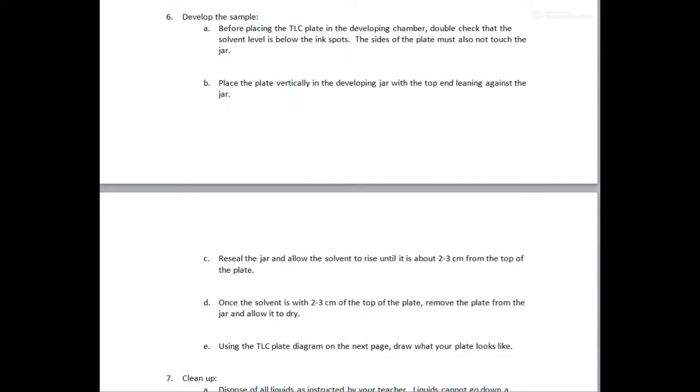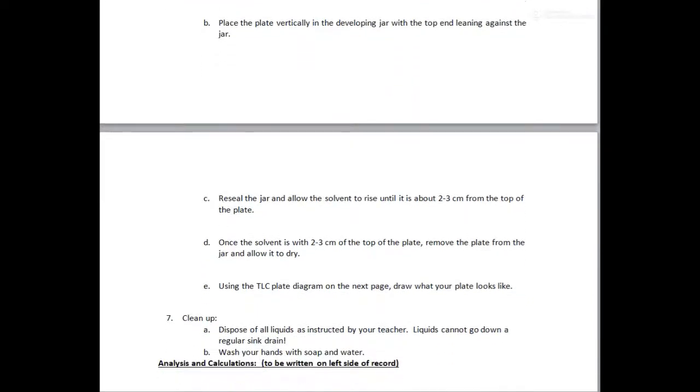Using the TLC plate, you draw what the plate looks like, and then you clean up and dispose of all the liquids which you have used, as per your instructor's instructions. Wash your hands with soap and water, and we'll see how a TLC plate will look.